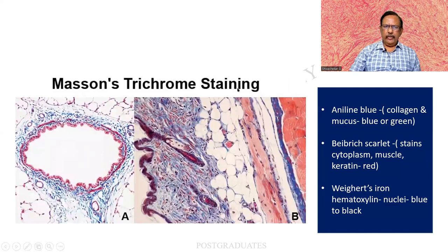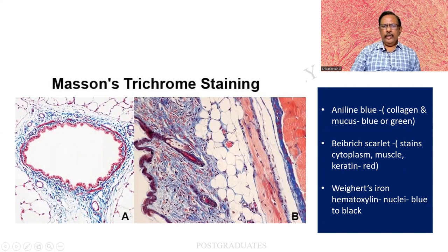Looking at a Masson's Trichrome slide, there is endothelium here, and then there is connective tissue — I am able to see a blue color. In a blood vessel or in skin, there will also be muscle that can be seen. So the muscle here is taking up a red color, and all the connective tissue is taking up a blue color. Aniline blue stains the collagen, Biebrich scarlet stains the muscle, and iron haematoxylin is for the nuclei of all cells.